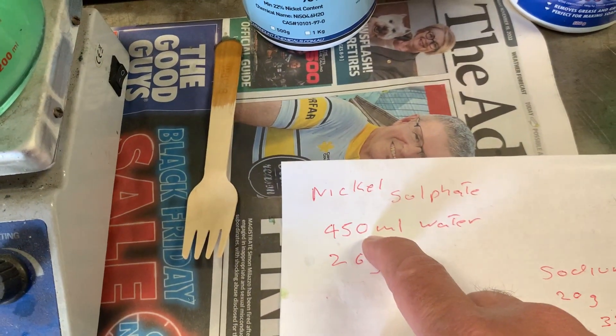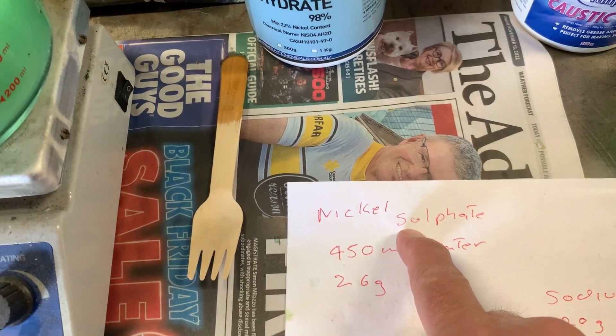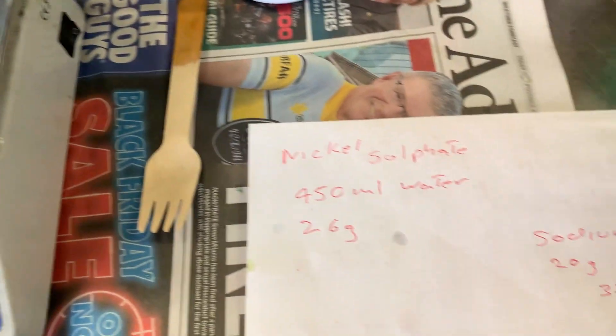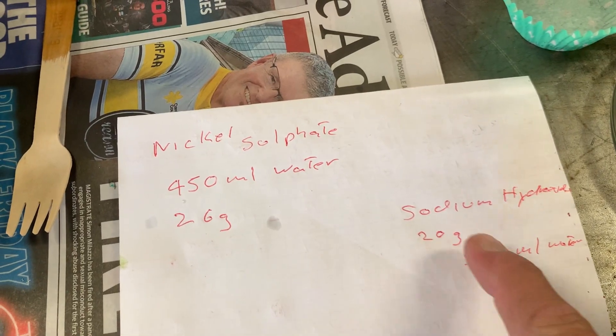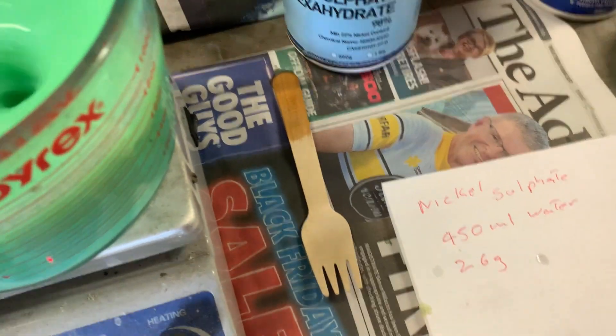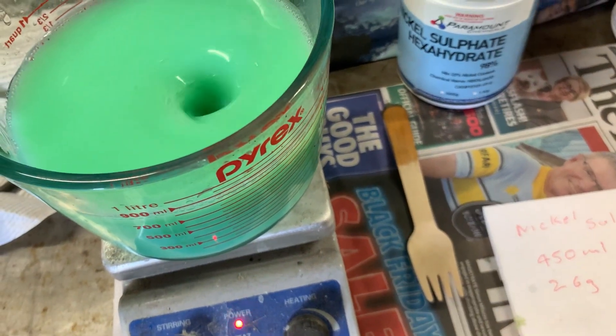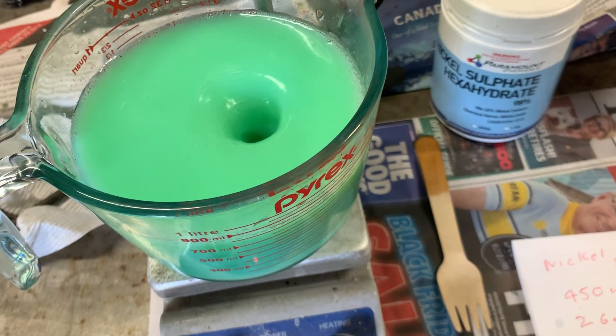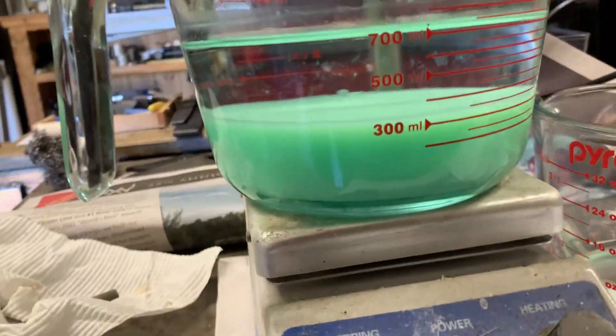To recap: you need 450 ml of water for the nickel sulfate, 26 grams of nickel sulfate, 20 grams of sodium hydroxide, and 350 mils of water for the sodium hydroxide.